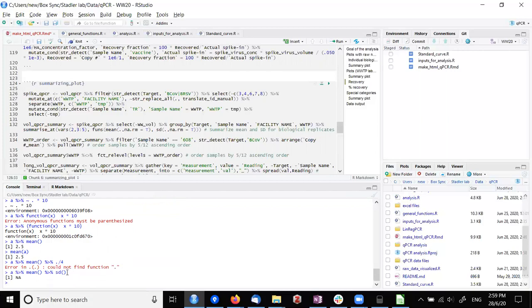Yeah, so you can chain multiple functions like that using this operator. So that's what I've done here. I go to that function, filter out things that I don't need, and then there's another function that's selecting only a few columns, and then it's changing the column names of a few things. So this translate that we made an empty string initially, it changes the names of things manually if you want to change anything. And then it's doing a lot more operations basically.